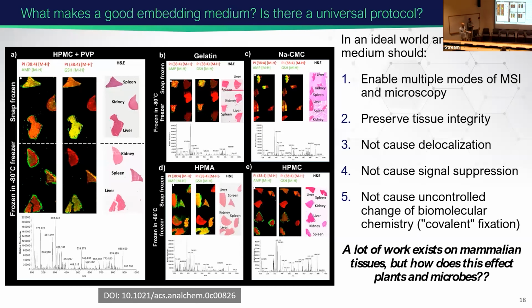You know that in some cases, probably for people from the clinical world, we use formalin-fixed paraffin-embedded samples. They are probably the best for preserving tissues, but they are not ideal for small molecule analysis, and they are completely not ideal for lipid analysis. It is just the way they are prepared in different organic solvents, where a lot of those hydrophobic compounds are already washed out and we cannot analyze them. But for example, for Kevin's work, or in the protein field, or for post-translational modifications like glycosylation, those samples are very useful, and we use them as well.